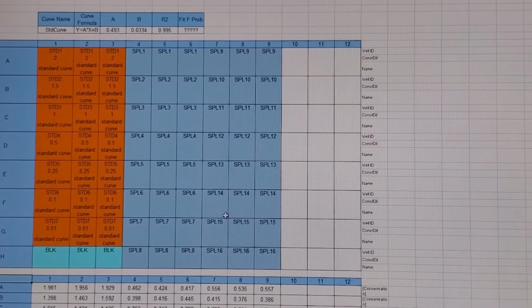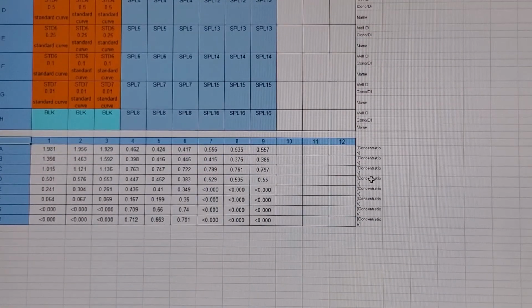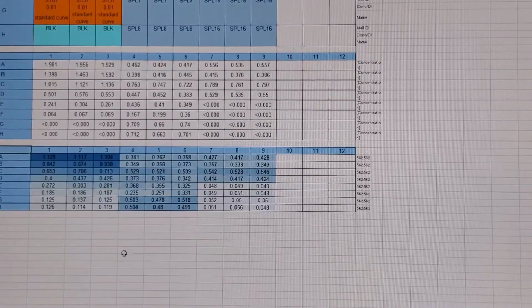So here we have the well IDs, the layouts. Here in the bottom we have the concentration, and you can do that if you want your raw values that were read at 562 nanometers. Click on, once again, that Excel symbol, and when you check your Excel, you'll see them right here. So this is pretty nice. And now you go ahead and save it, and you're ready to analyze your data and calculate how much protein you have in your samples in order to load onto your SDS-PAGE.